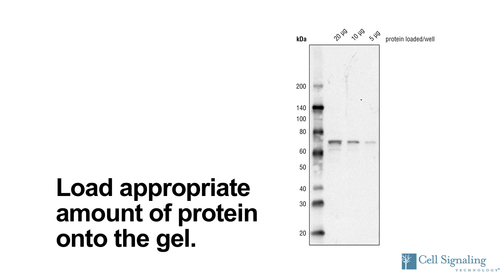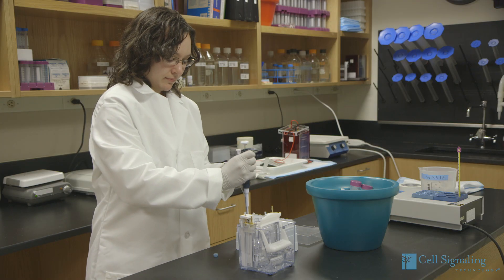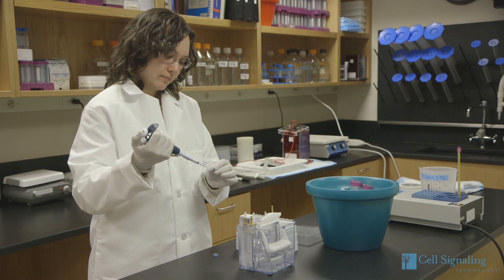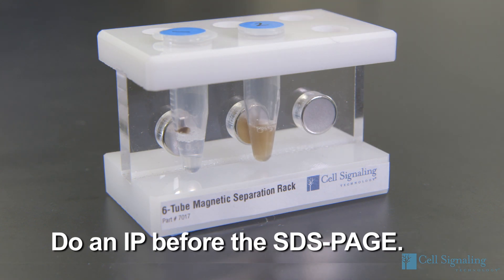Thirdly, undetectable protein can also result from inadequate loading of lysate onto the gel. CST recommends loading 20 mcg of protein lysate per lane. However, if protein levels are below detection, 40 mcg or more of protein can be loaded, or an immunoprecipitation prior to running the SDS-PAGE may be necessary.